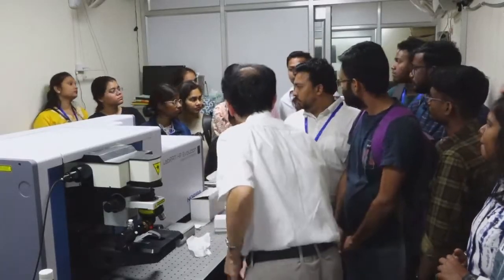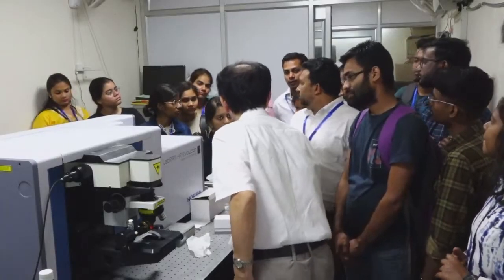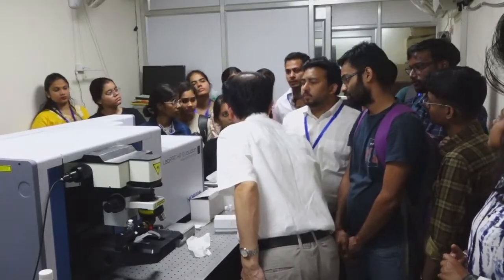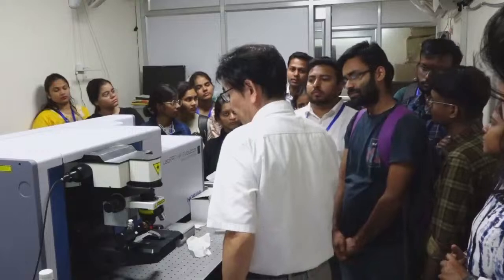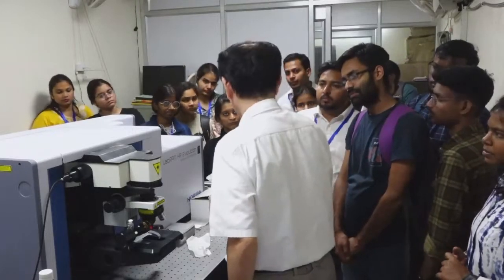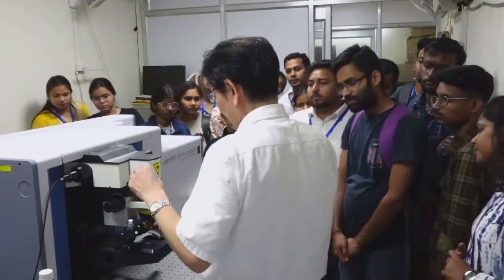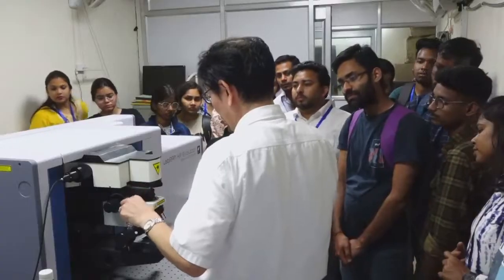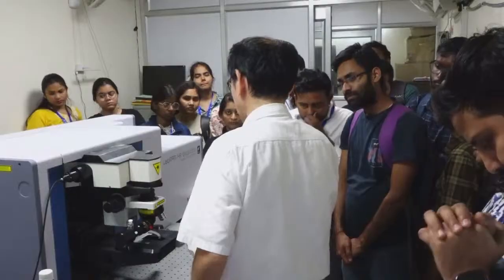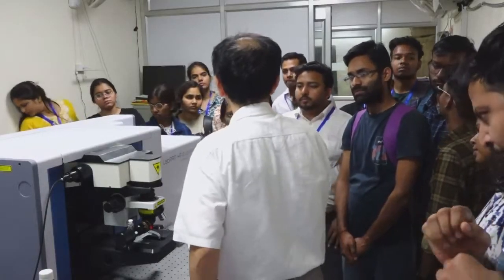Can this machine measure all types of Raman spectra, either conventional or surface enhanced Raman? Can you measure all types of Raman from that? Must be possible. The surface enhanced Raman is achieved by adding nanoparticles into the liquid sample, but probably some stirring is necessary.